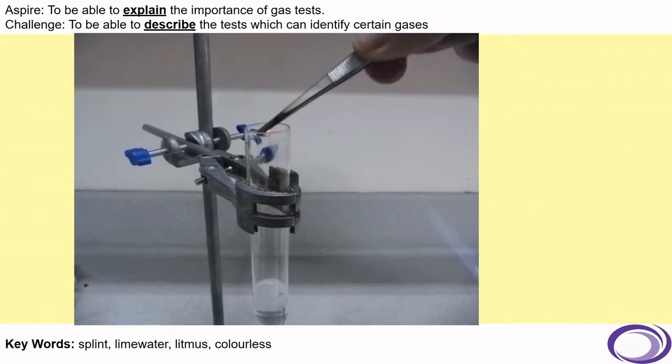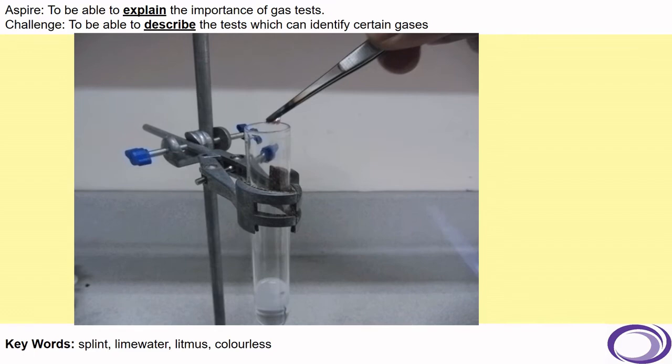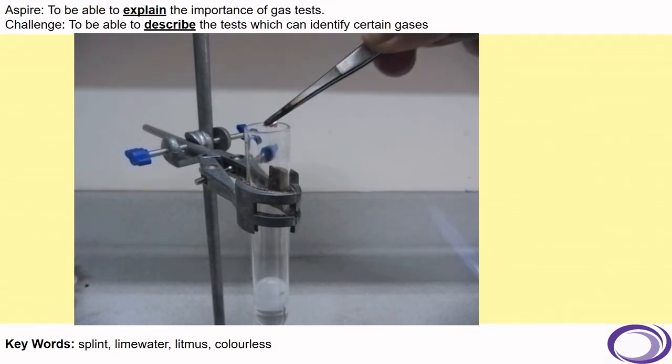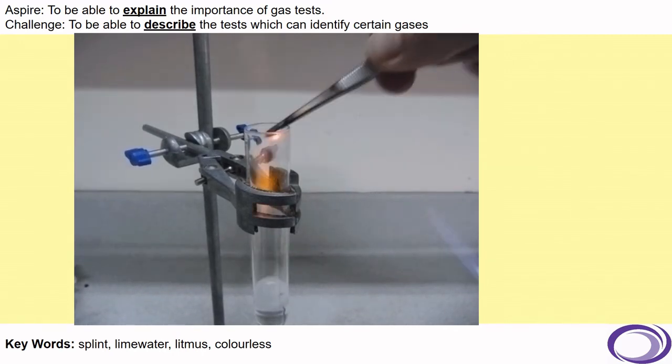Now, this has frequently been called the squeaky pop test, but better practice in exams, if you are asked to describe this test, is to describe how you would carry it out. And then the result of this test is the popping sound.